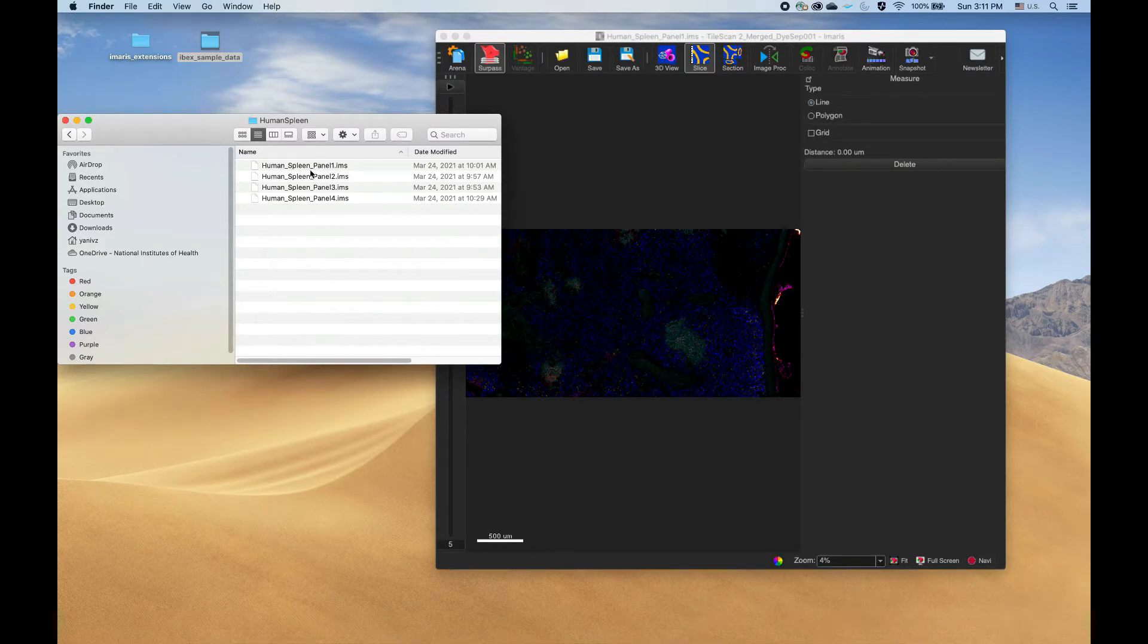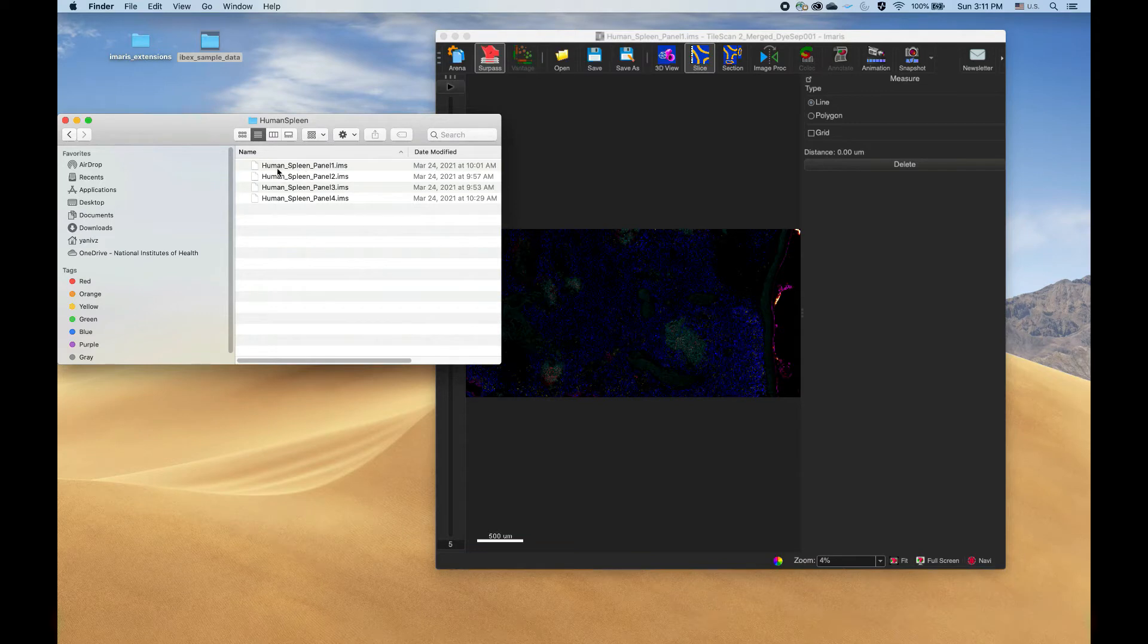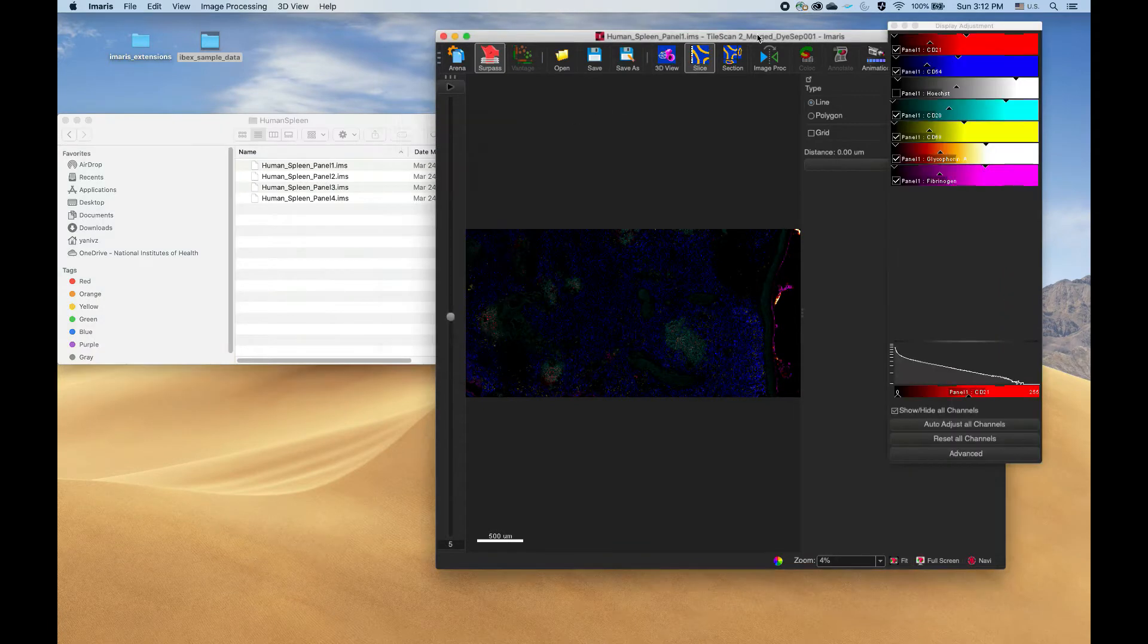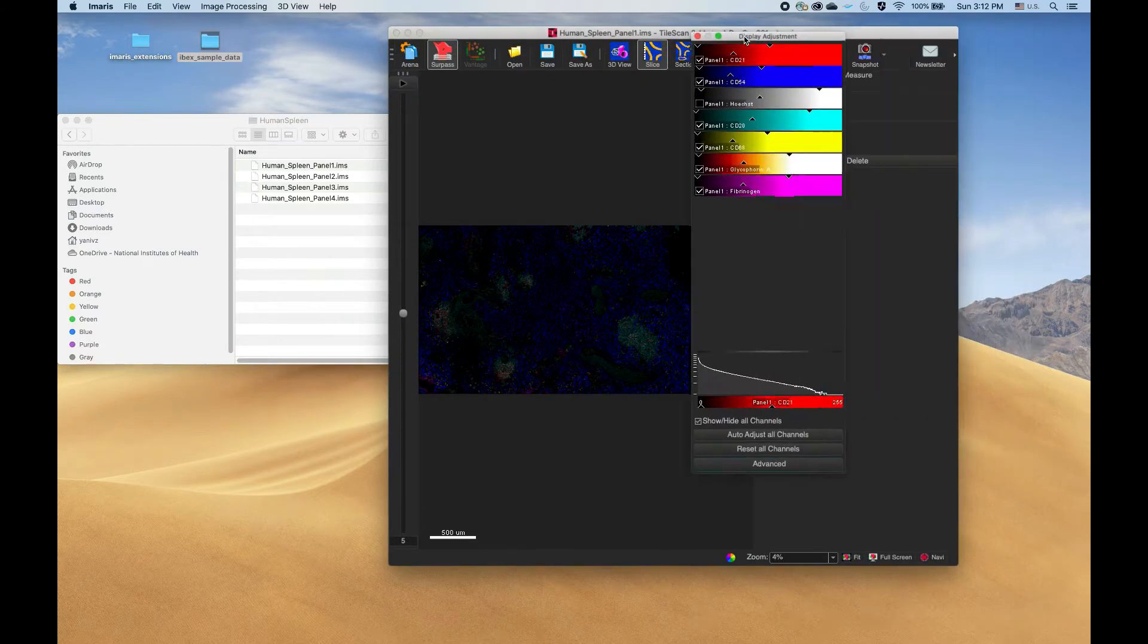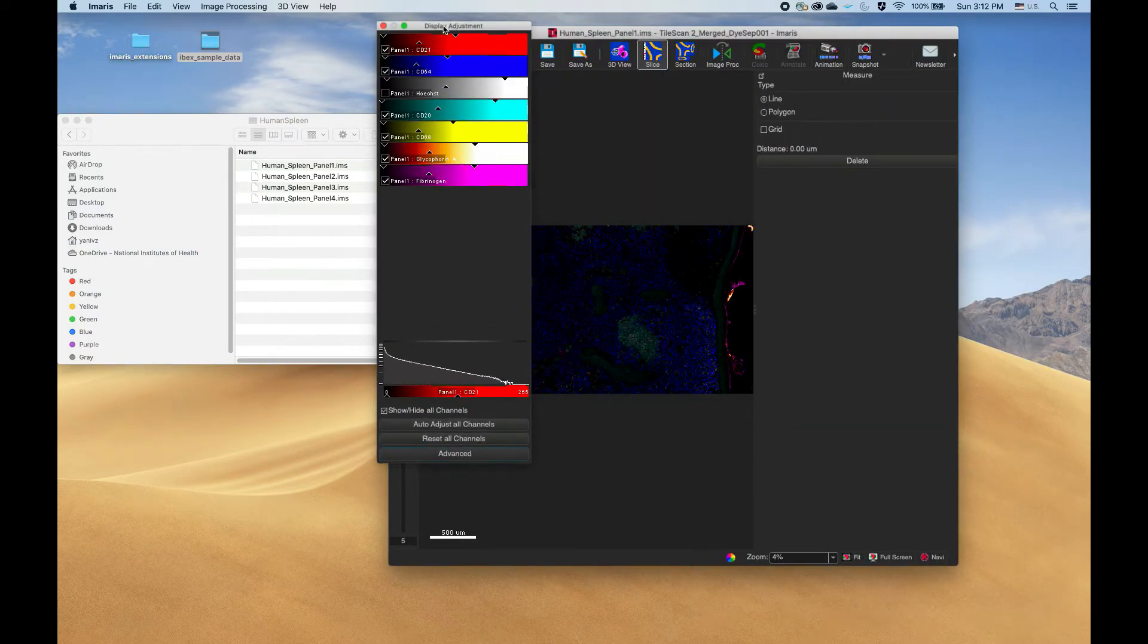As you can see, they're all named human spleen panel and panel number. That's not critical for working with the extension. It's just nice that the file names are relatively short because we use them later on in plotting some graphs, but no real requirements on the file names.